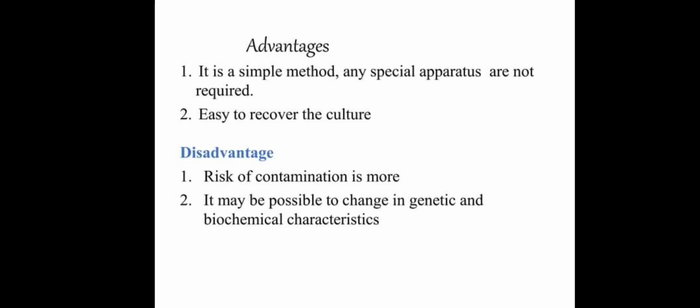Advantages: it is a simple method, no special apparatus is required, and it is easy to recover the culture. Disadvantages: the risk of contamination is higher. It may be possible to change the genetic and biochemical characteristics.